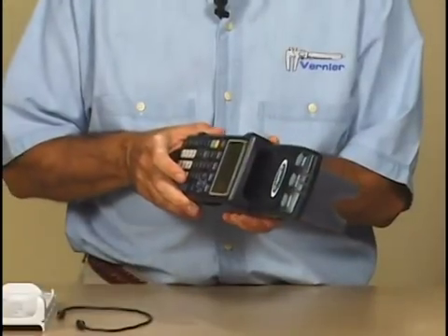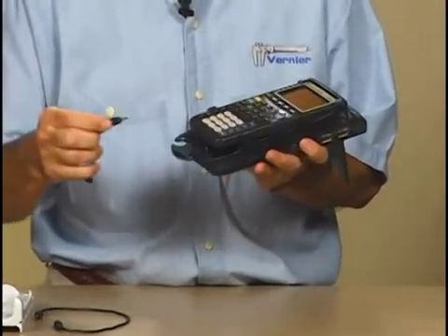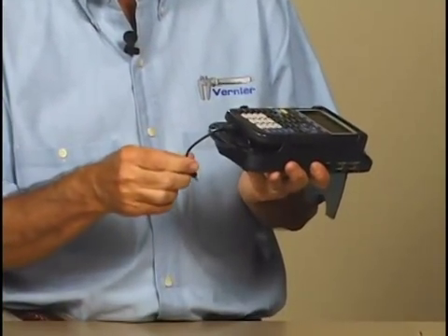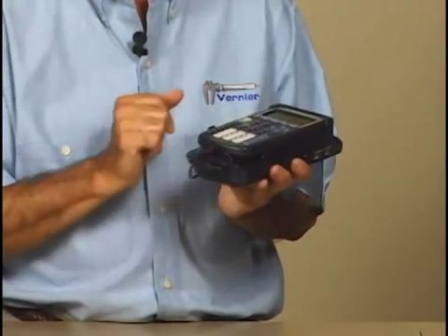Then the cradle will slide on the top of the LabPro. It clicks. The small cable plugs into the bottom of the calculator, and then it connects into the bottom of the LabPro. And then we're ready to collect data.